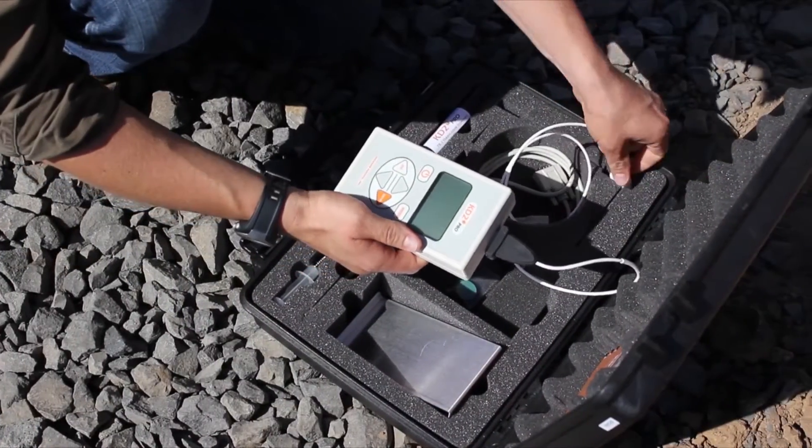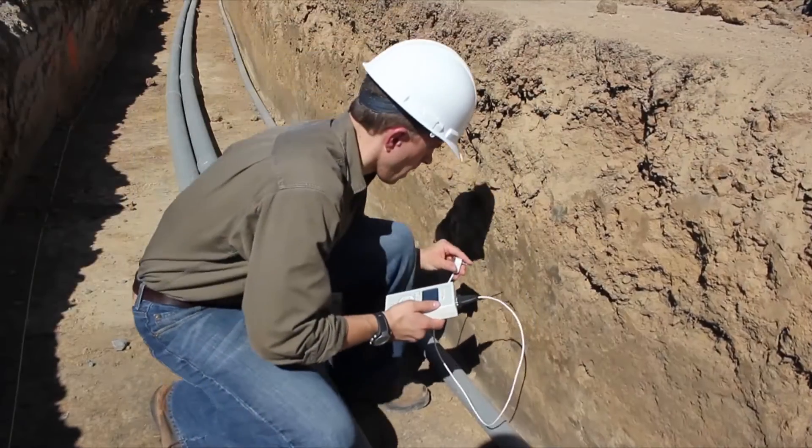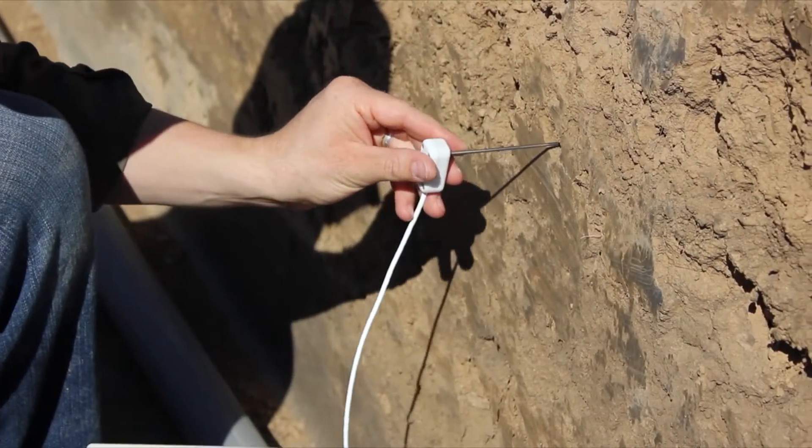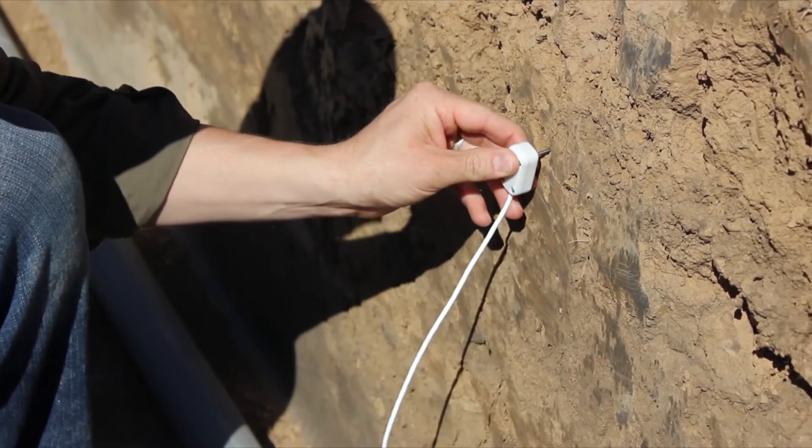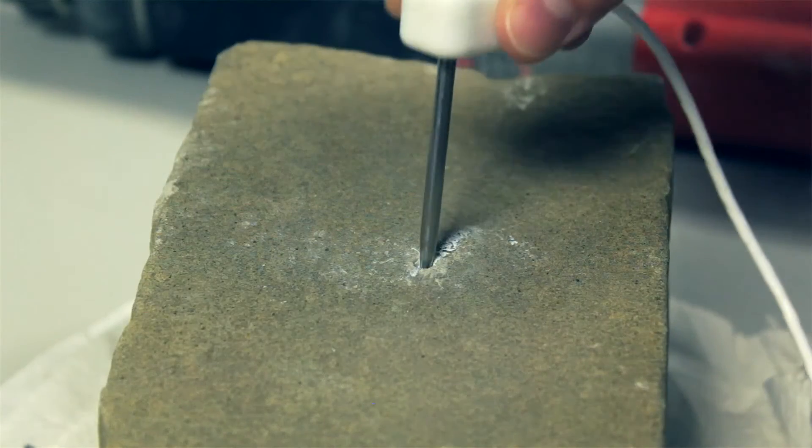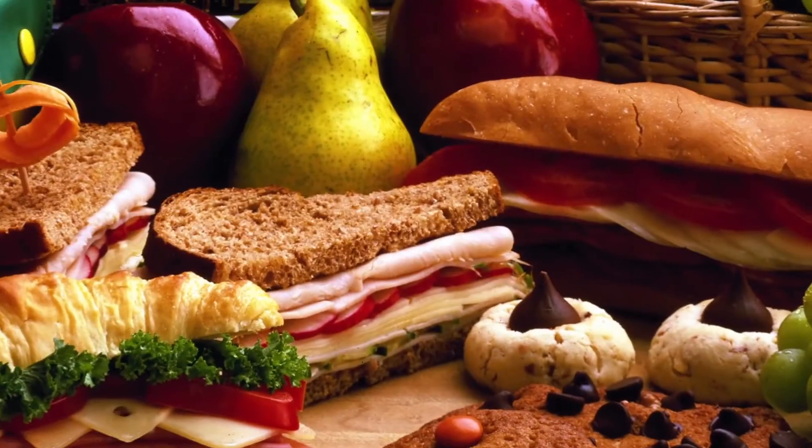Popular applications include soil thermal resistivity around underground power cables, thermal conductivity of concrete, thermal conductivity of nanofluids, the thermal resistivity of insulating materials, and thermal properties of food.